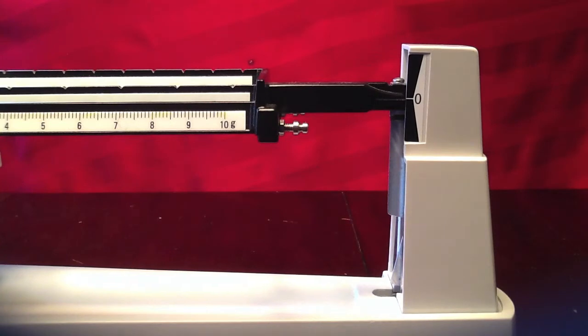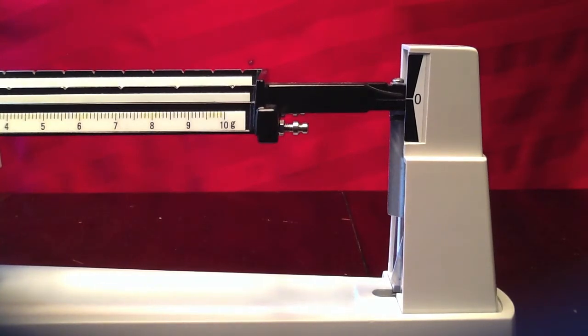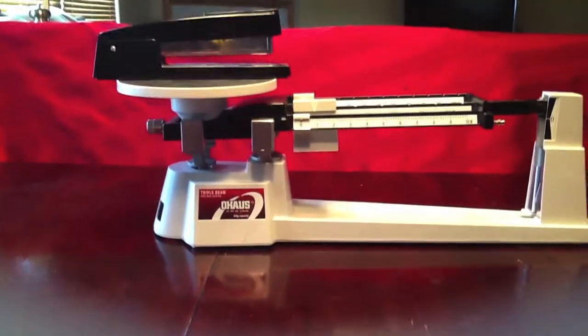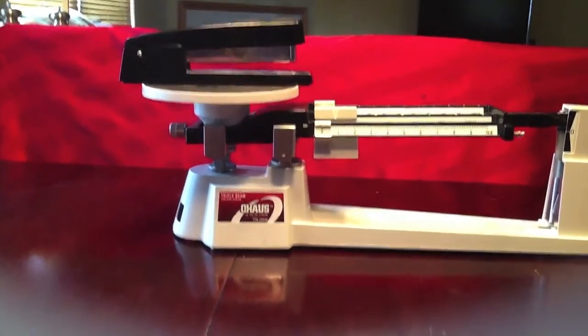Now that we have zeroed our scale, we're going to place our first object onto the pan. Today our first object that we're going to be measuring is a stapler.